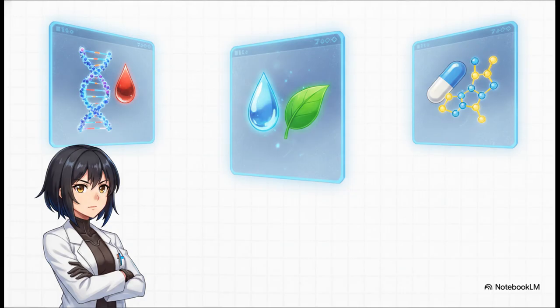In clinical diagnostics, doctors are using mass spectrometers to analyze blood or urine, identifying specific disease biomarkers long before you'd ever feel a symptom. In environmental monitoring, it's the absolute gold standard for detecting dangerous trace pollutants hidden in our air and drinking water. And in pharmaceutical development, it's essential. It's how we assess the purity of new drugs and track exactly how our bodies metabolize them.